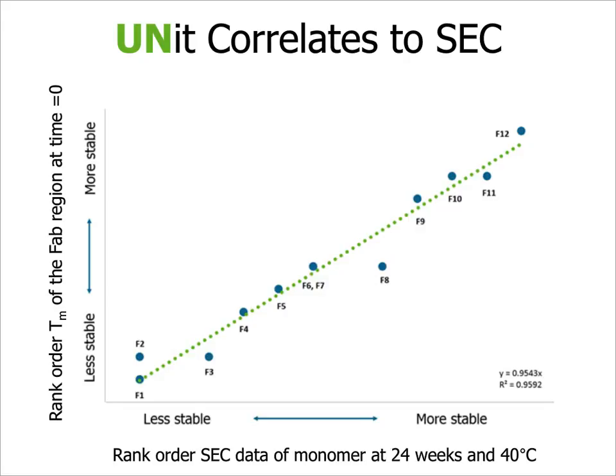So the value here, we can measure in 2 hours data which gives us an indicator of protein stability versus 6 months with far less protein consumed. Now obviously we're going to be doing accelerated stability with SEC anyway, but the value of these measurements is that it allows us to remove those formulations which we may have had to measure anyway, but now we can see that they're going to be very poor in terms of stability, so we can save ourselves significant time.